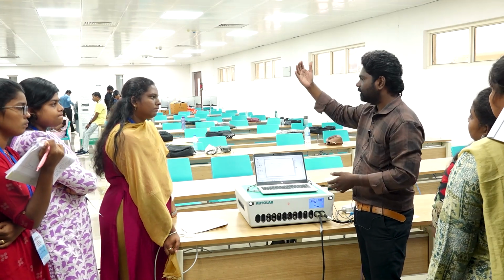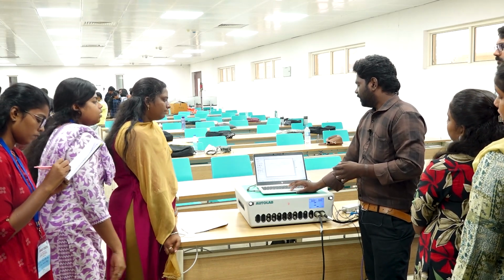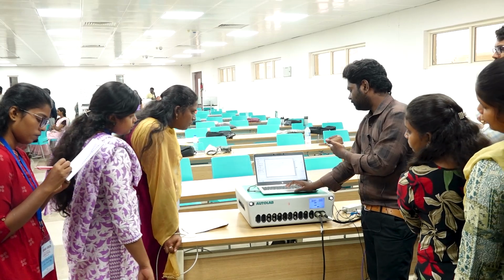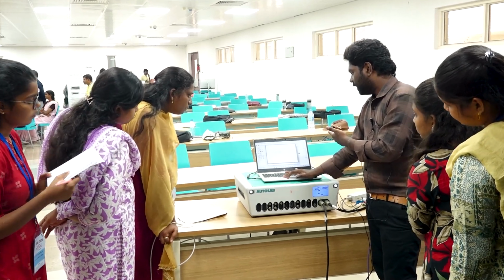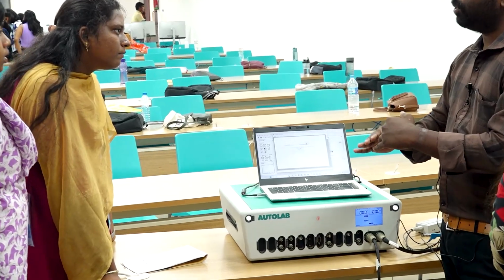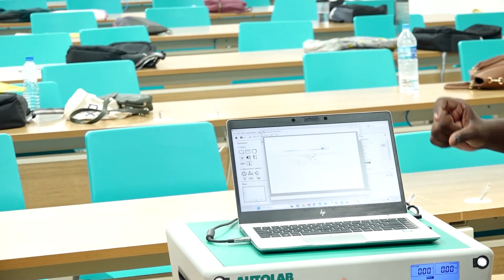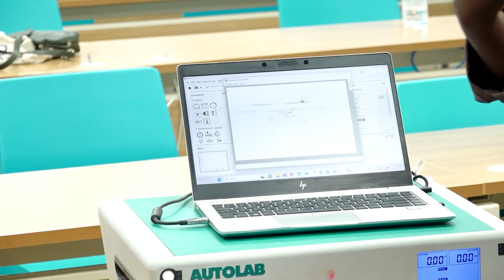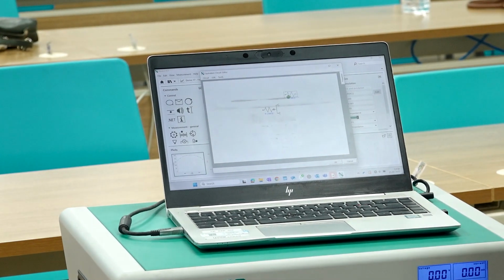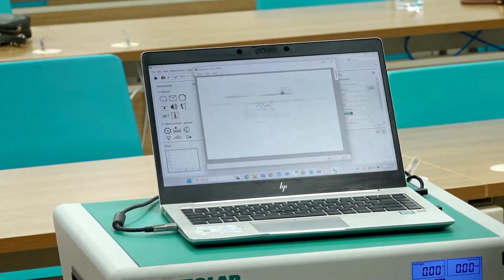So resistance and capacitance. Okay, so go to add elements, resistor. Is it any problem if I put the resistor at the bottom and the capacitor on top? Is any fixed point there, or is it just your view? I am just asking. We know we have to put it in parallel. Either resistor should be on top or capacitor should be on top.